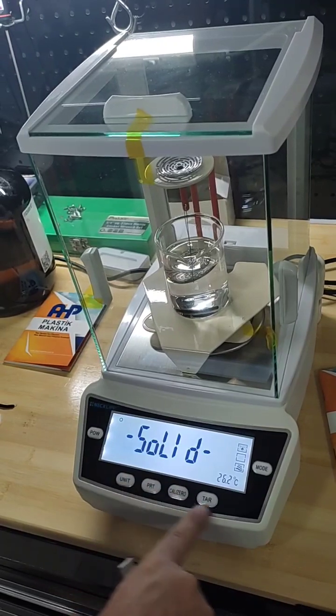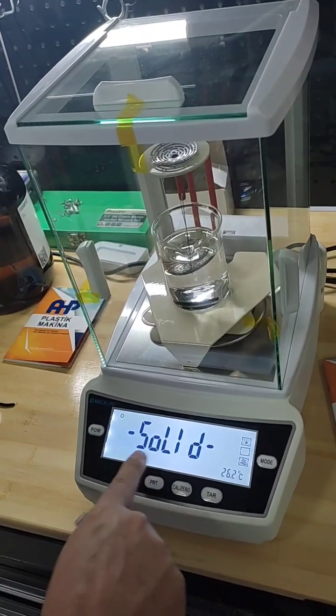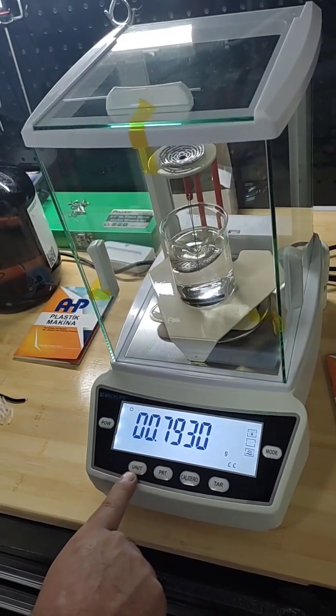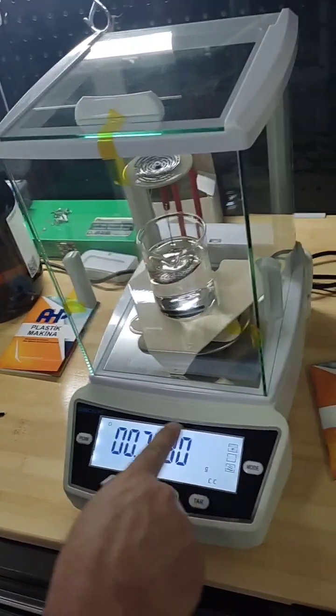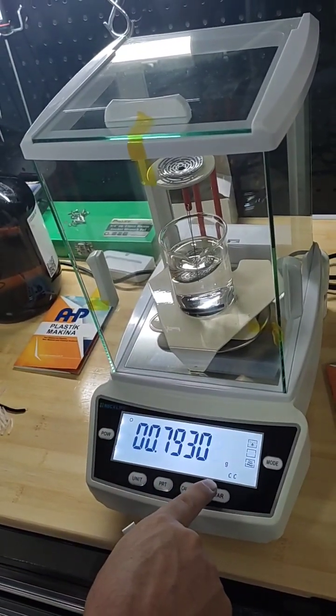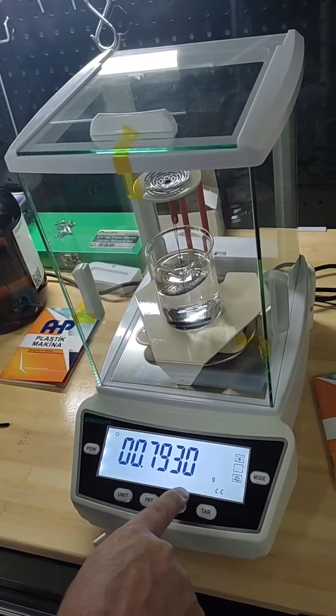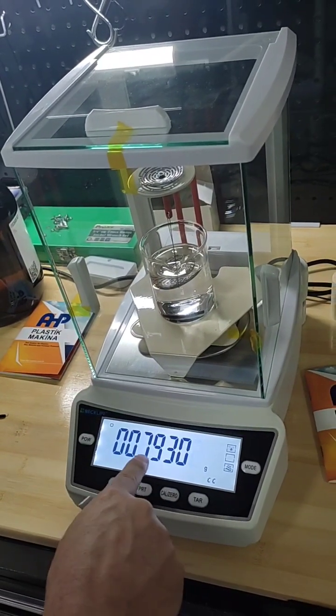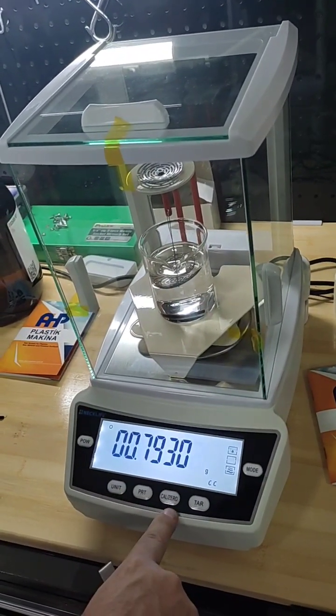When it shows solid, you can click on unit. This is the value for the liquid density. It is methanol. I'm just entering this value for the density of methanol here.